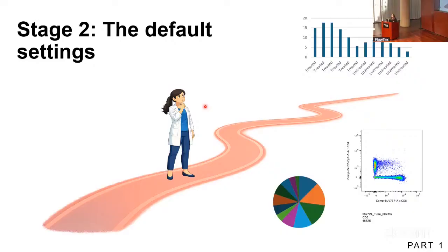Like maybe you make a pie chart of the different cell populations, maybe you make a bar chart. You're just happy that the dots are on the plot, they're not doing bananas, they're not going outside your gates. And honestly, this is already a very hard thing to do, and you're already halfway there if you just get to dots that look like that.